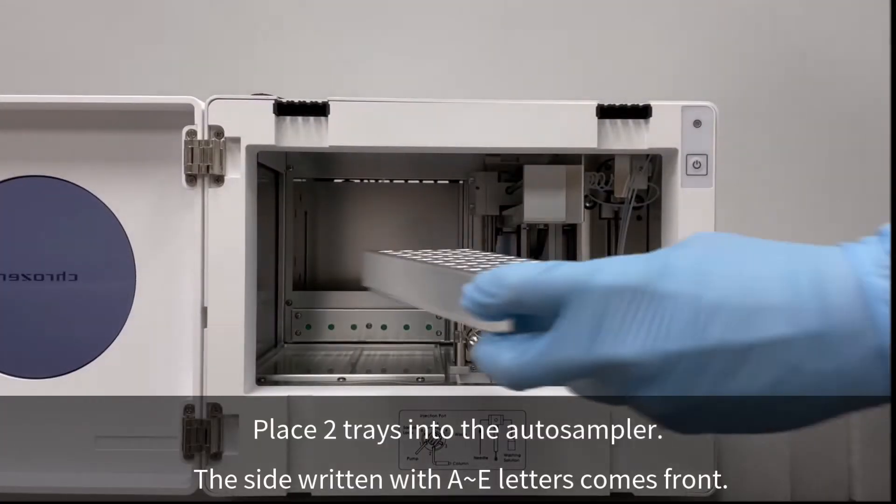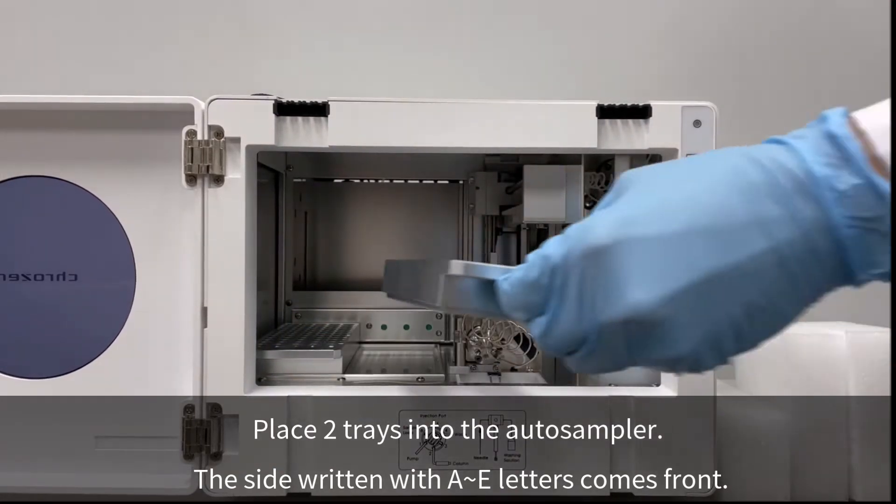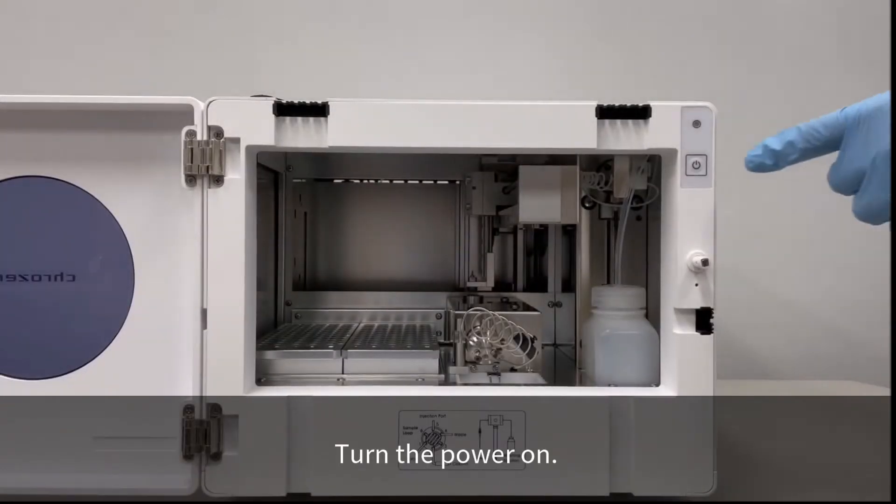Place two trays into the Autosampler. The side written with A to E letters comes front. Turn the power on.